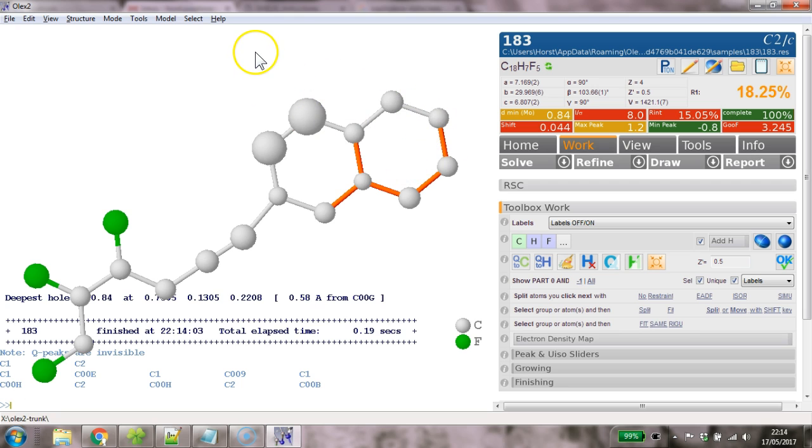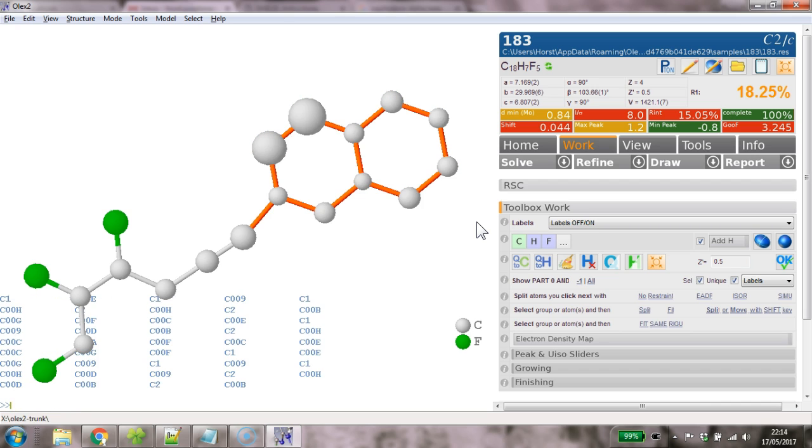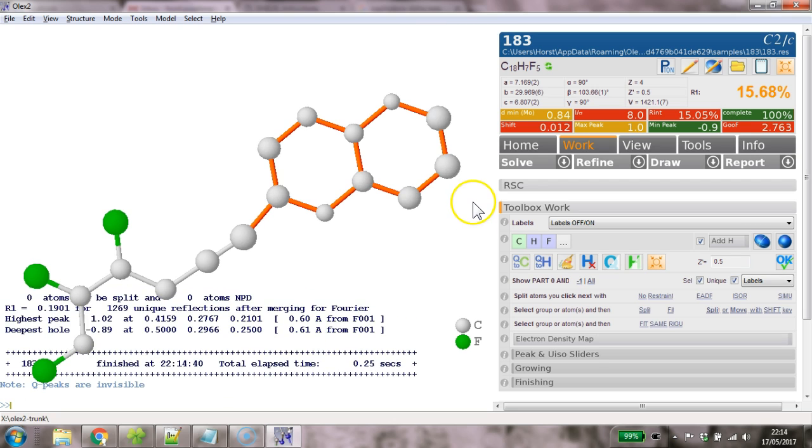And we obviously have missed some here. So what we do, we select the whole thing and go part minus one and then also 0.5, make them half occupied and issue this PV again. And now we see that all of these things are in part minus one and we refine this and now it looks really good.